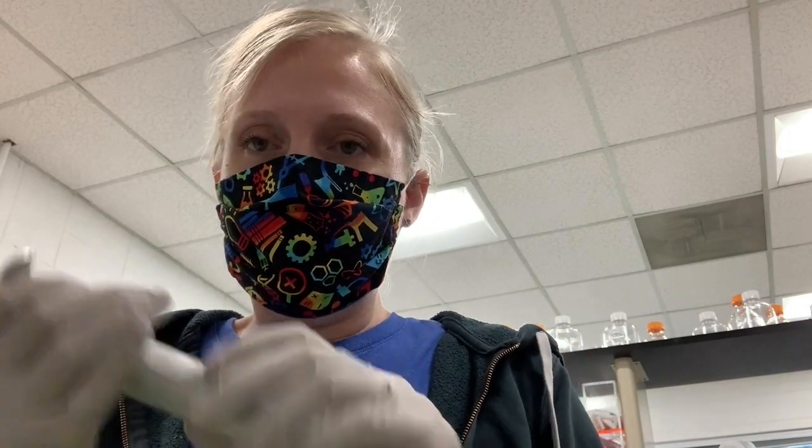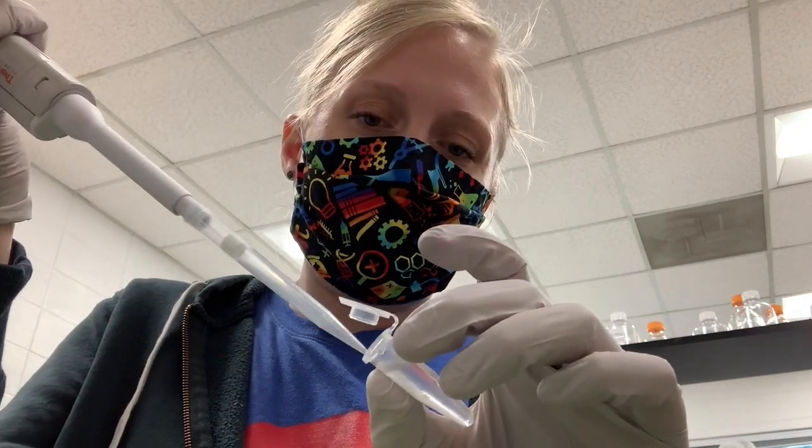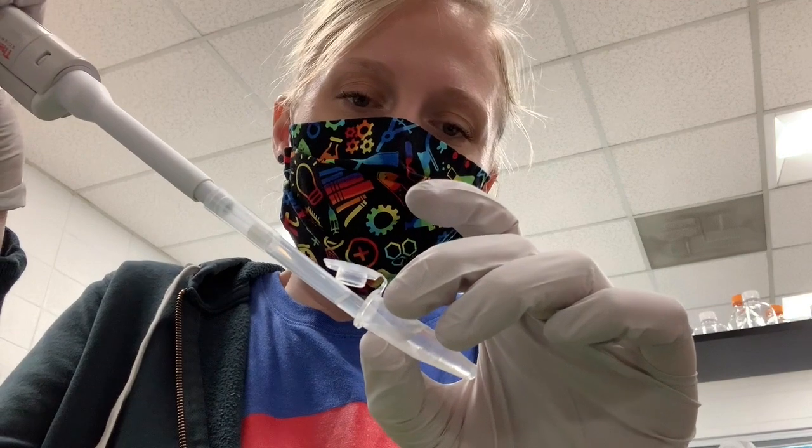remove the ethanol and ammonium acetate mixture. You can have a waste container, like either just an empty tube or one of those tri-corner beakers for your liquid waste. So what you're going to do is remove the liquid without disturbing the pellet. So you don't want to suck up the pellet. You want to make sure you can see it, and we're just going to pipette away from it.